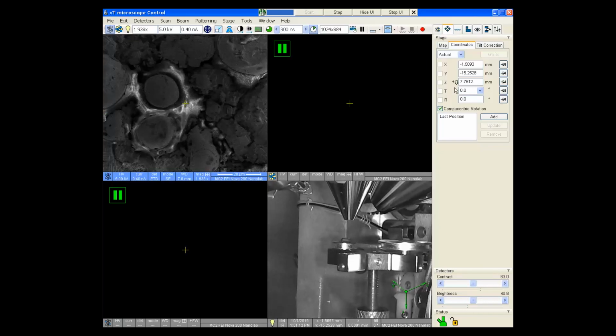In the linked coordinate system, 0 millimeters positions the surface of my sample against the lens, and large values move the sample down away from the lens. This is much more useful for a microscope operator to work in this coordinate system instead of the raw stage height. So now I can tell the software to go to any working distance that I want for my imaging.